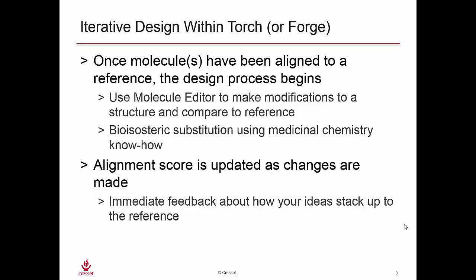To do iterative design within Torch, we need to have our molecules aligned to our reference, and then we begin our design process. We'll use Cresset's molecule editor to make modifications to a structure and compare those modifications back to the reference. This is bioisosteric substitution using our medicinal chemistry know-how. As we make changes to our molecule, we'll see that the alignment score is updated.